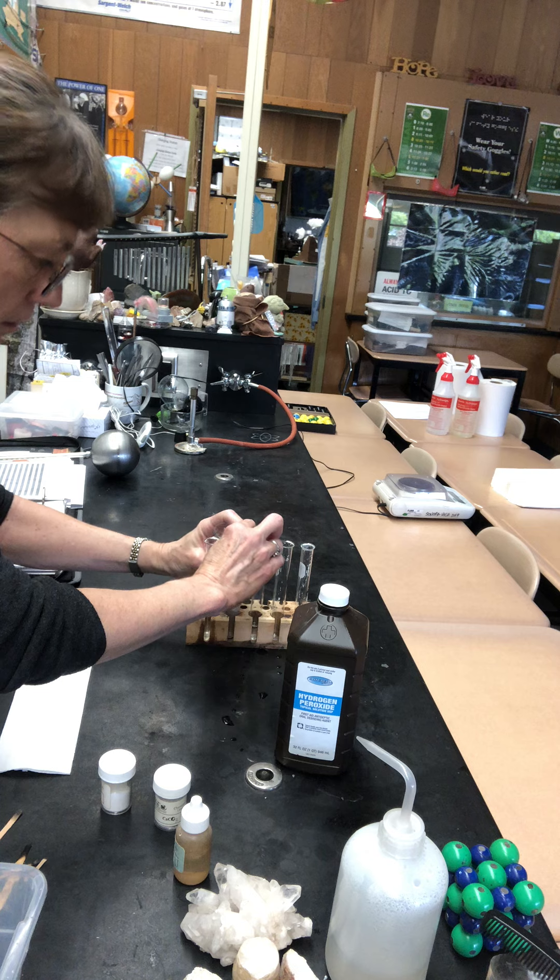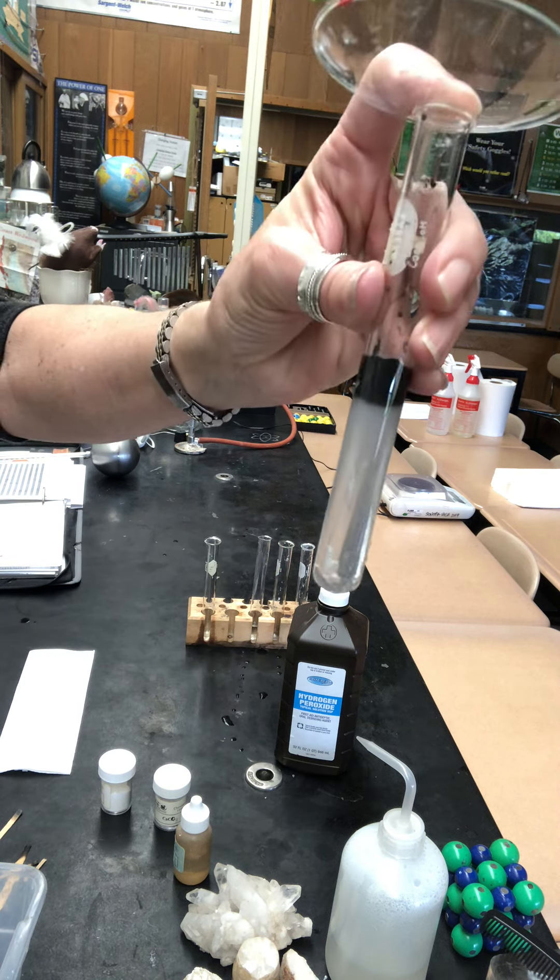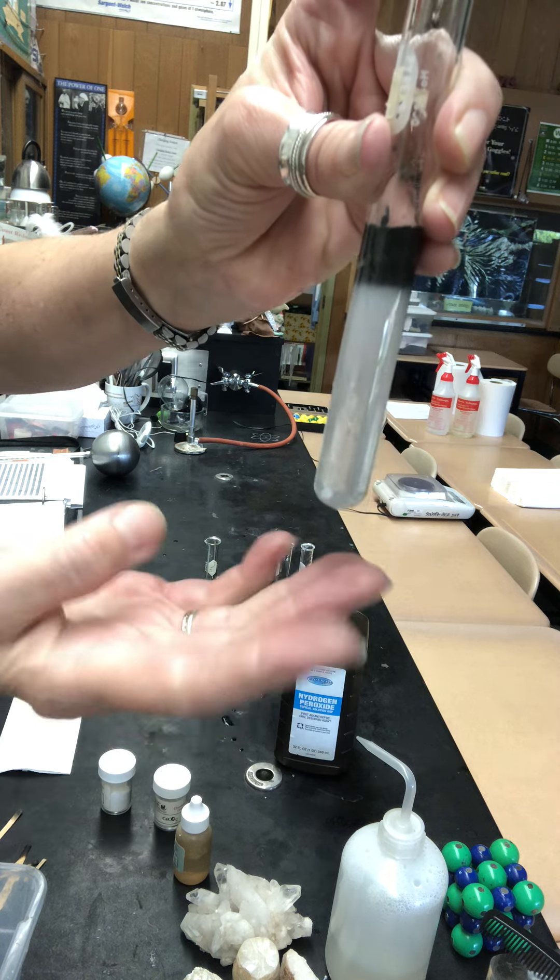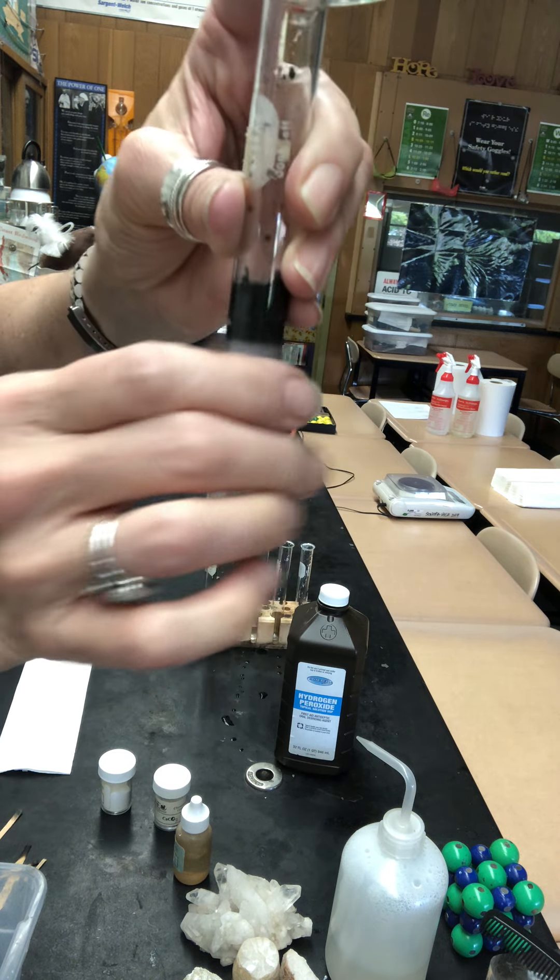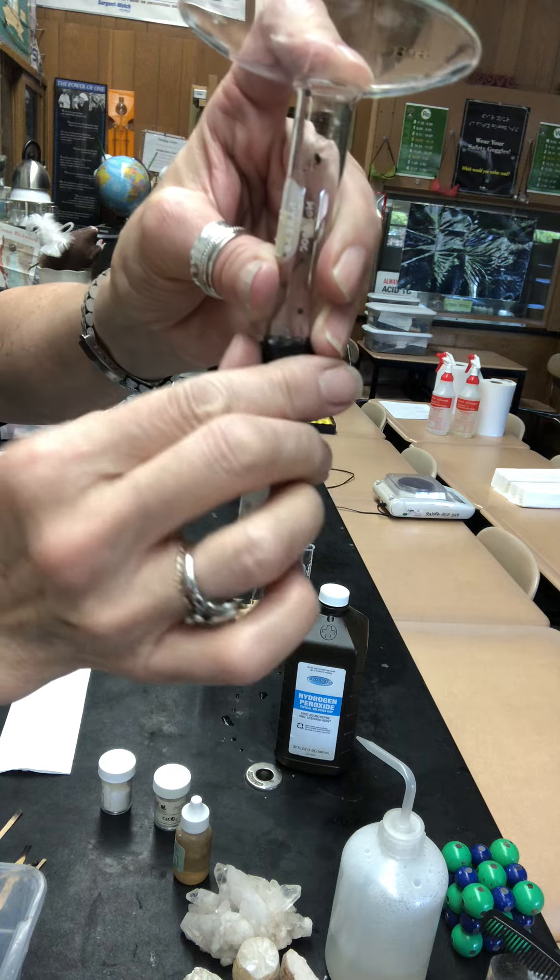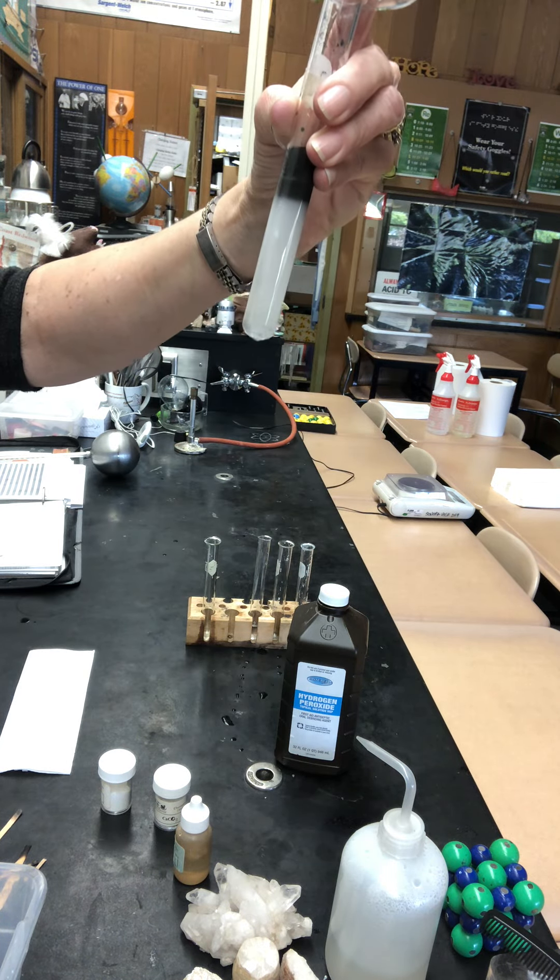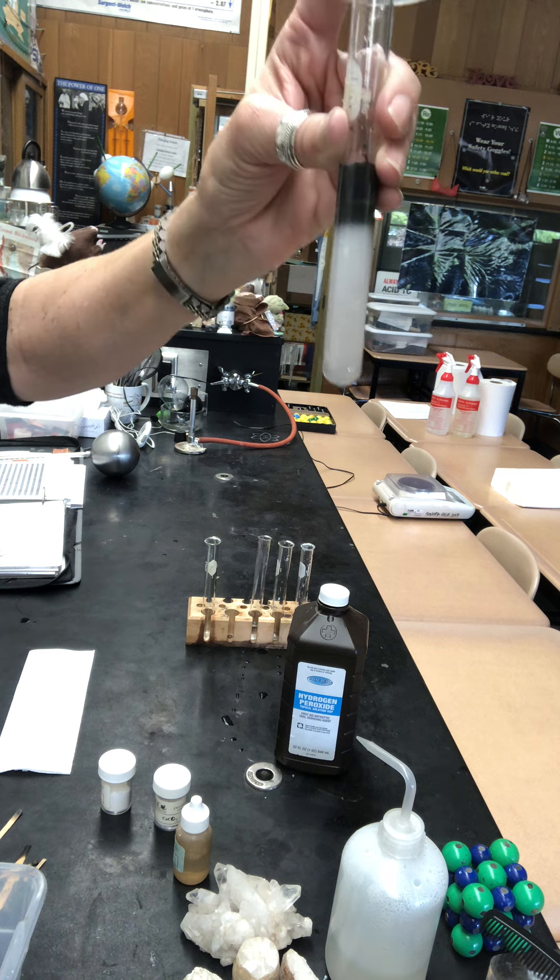So I'm going to trap this. You can see that the hydrogen peroxide is bubbling. It was clear and colorless to start with. It's a little bit warmer here. It's a little bit hard to tell. Looks like I had a dirty test tube.